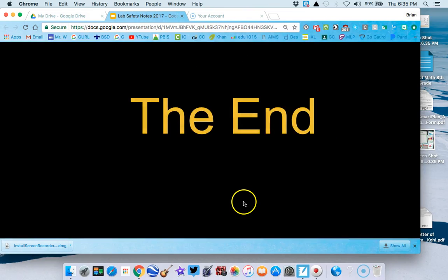That's the end of part two — a much shorter video. Make sure you have all these notes.